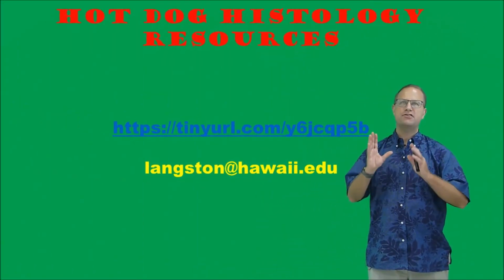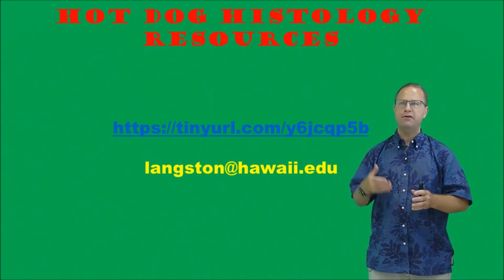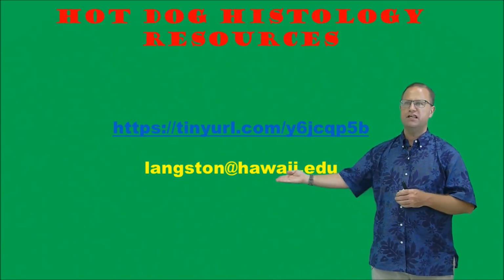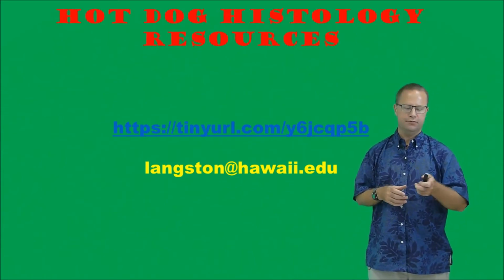Okay, now that we've finished sectioning and staining our hot dog tissues, we have photographed them underneath the microscope, and we've posted those images here so you can download them and use them with your class. So if for some reason this link doesn't work, you can just email me at langston@hawaii.edu, and I'd be happy to share the images with you.